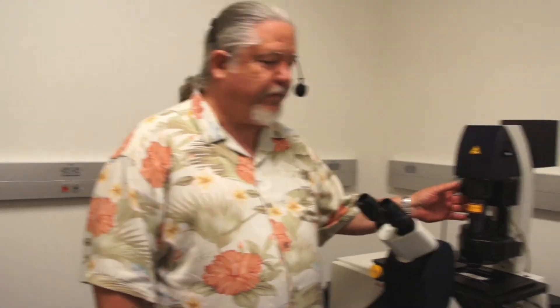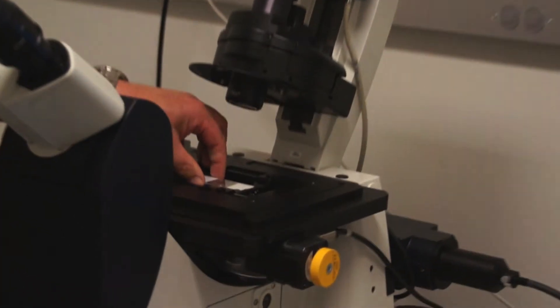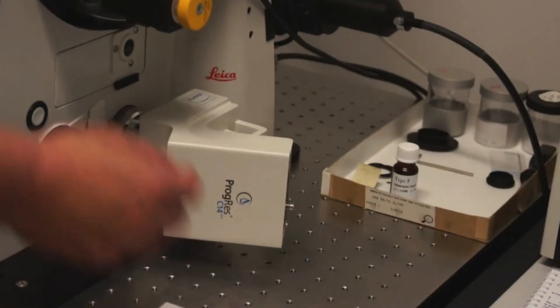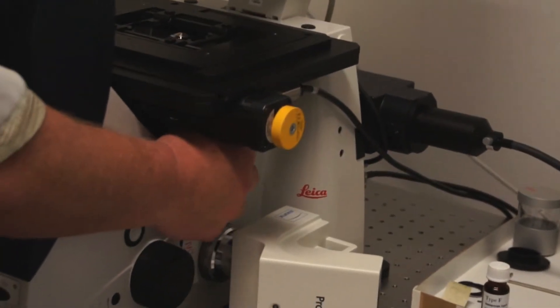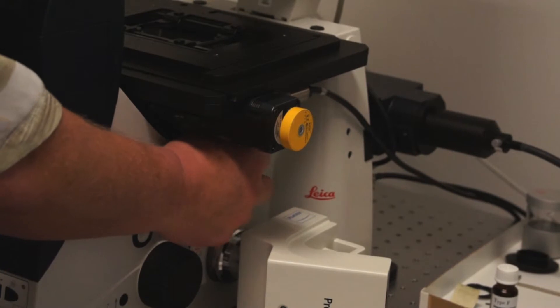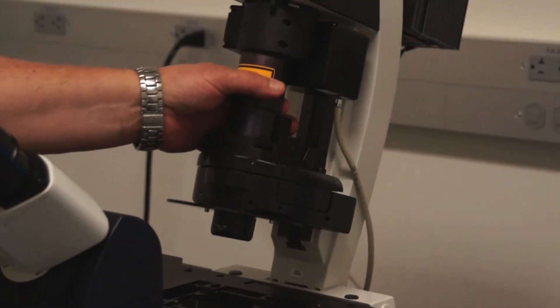Before we end our current session, it's important to follow proper shutdown procedures for using the light microscope. The first thing we do is rotate our condenser out of the way. We take our specimen off the stage and set it aside. We dial our nose piece all the way down past the 10x objective to the blank spot, then put the condenser back in place.